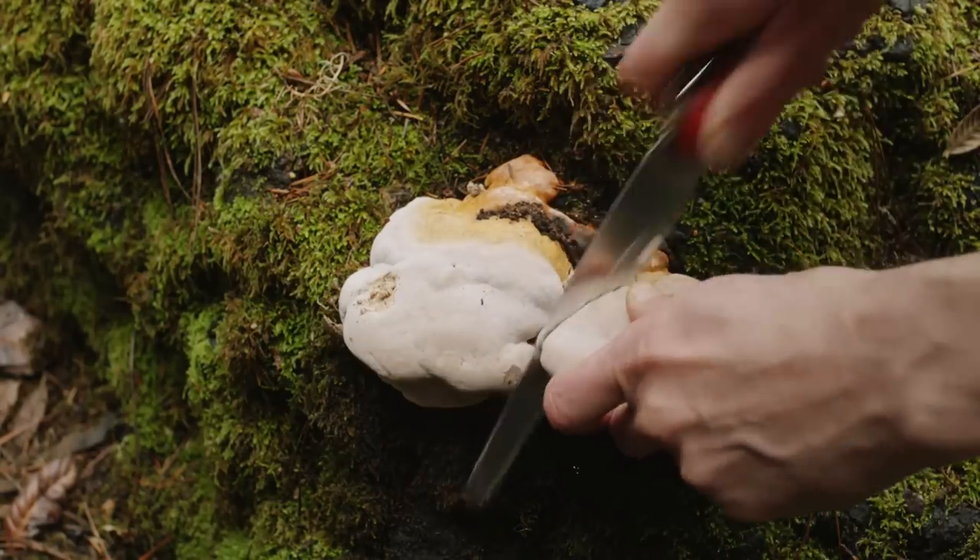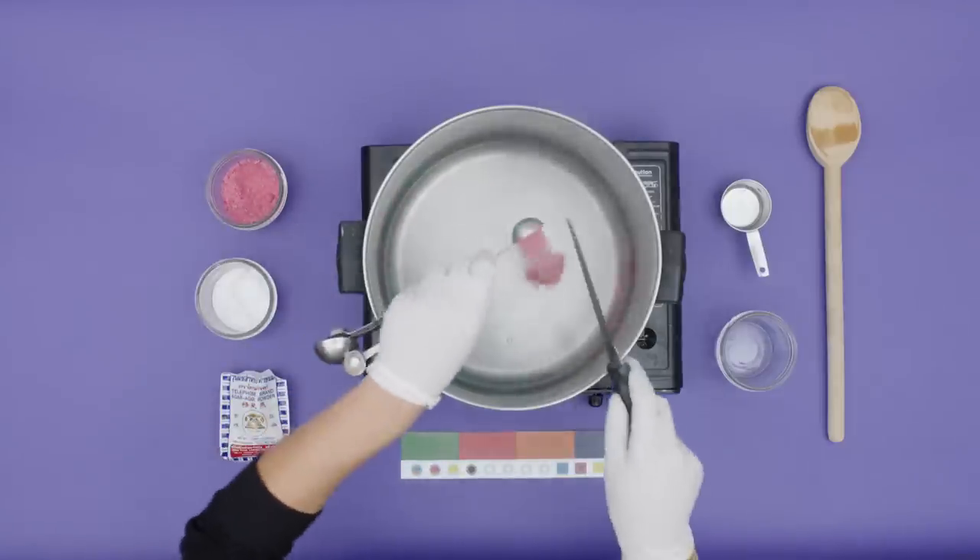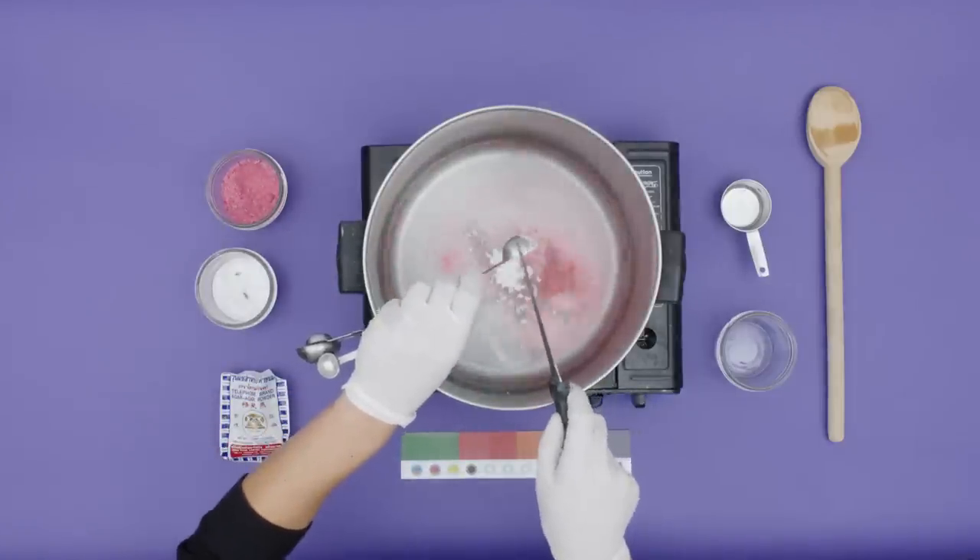Step one, collect the mushroom sample. Step two, prepare the agar, a gelatinous substance obtained from seaweed.